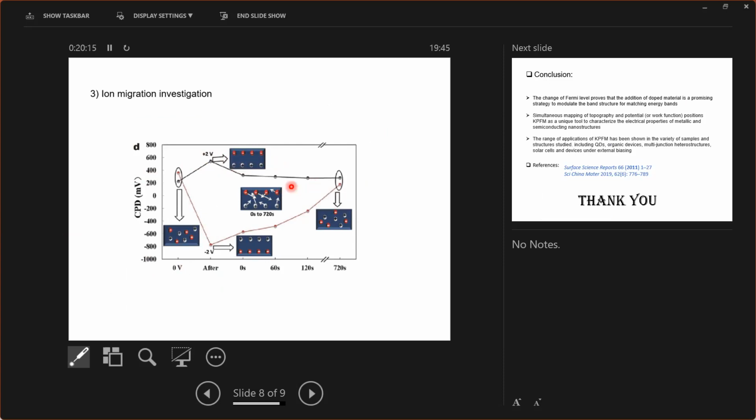And sir, can you do this kind of thing with the electrolyte side? They also apply potential. Then what can be happening within the surface at different potential? See, it is a time lag. Yes, this is the time lag, 60 seconds, one minute, 2 minutes, like that. So one thing, of course, you can do that. You can see the voltage change. You can fix the point and then vary the time. If you do it at multiple locations, it will not make any sense.